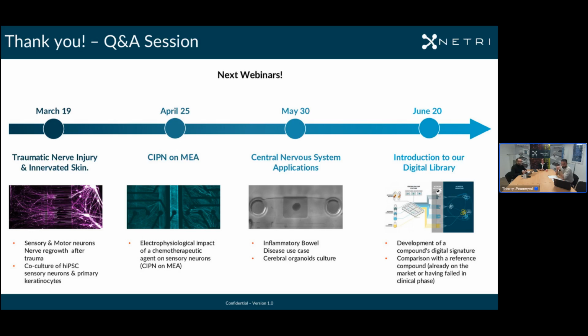So it's really cell type dependent, and we try several coatings. I will just mention one thing: never use PEI. As Axion recommends, it doesn't work in combination with the microfluidic on top. But yes, like any culture vessel, you need to coat.